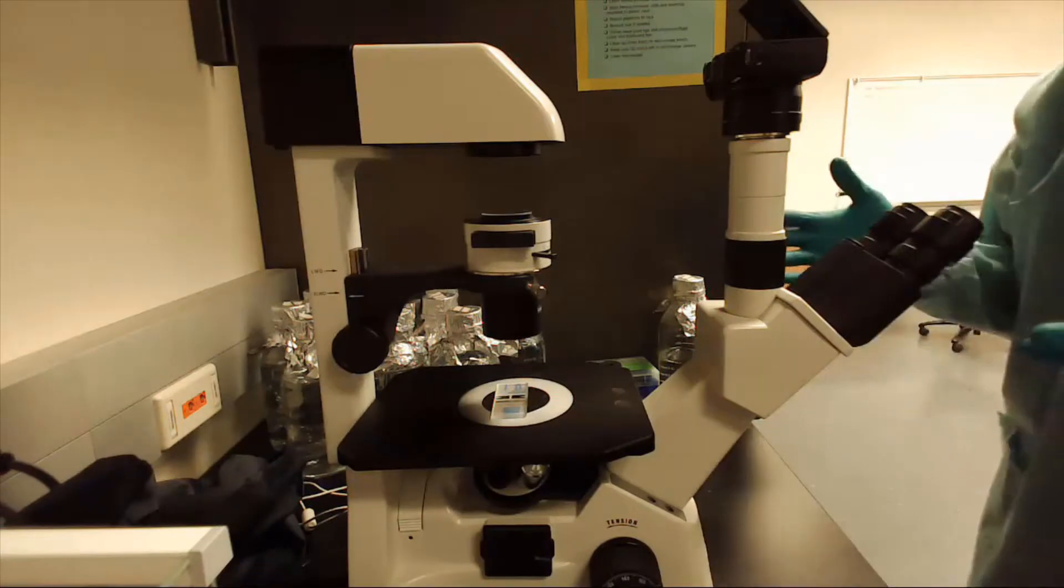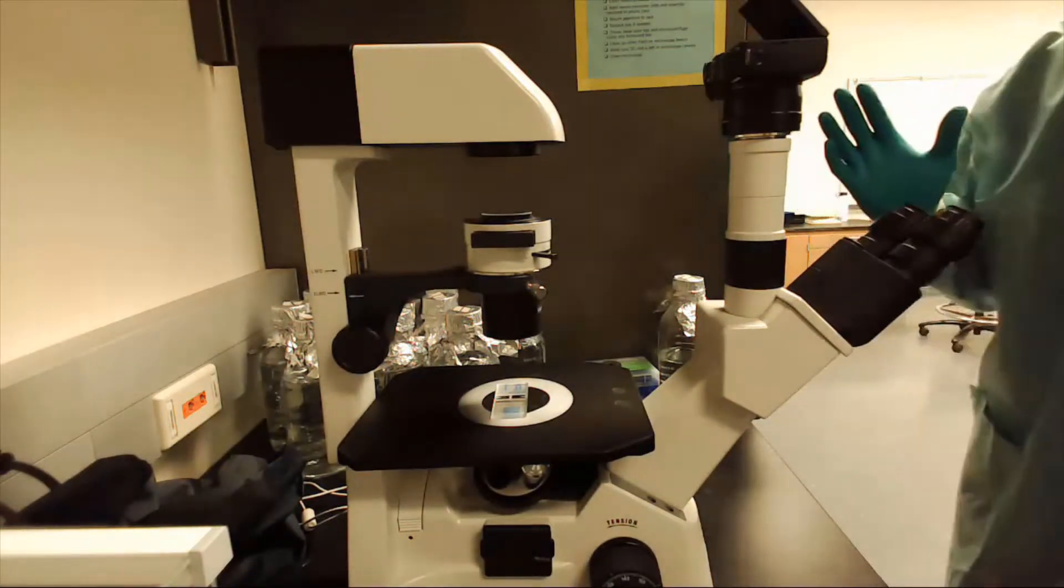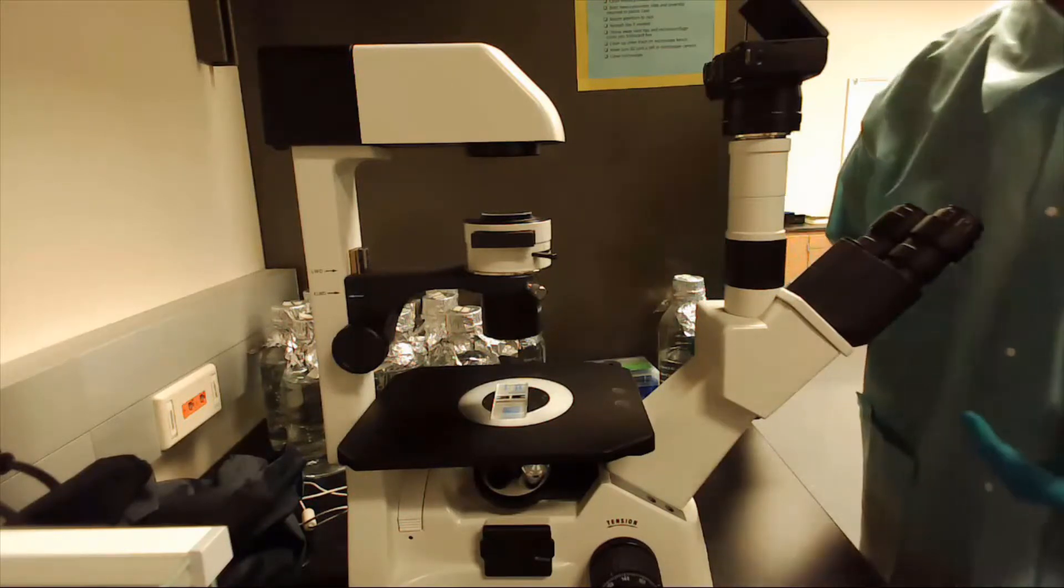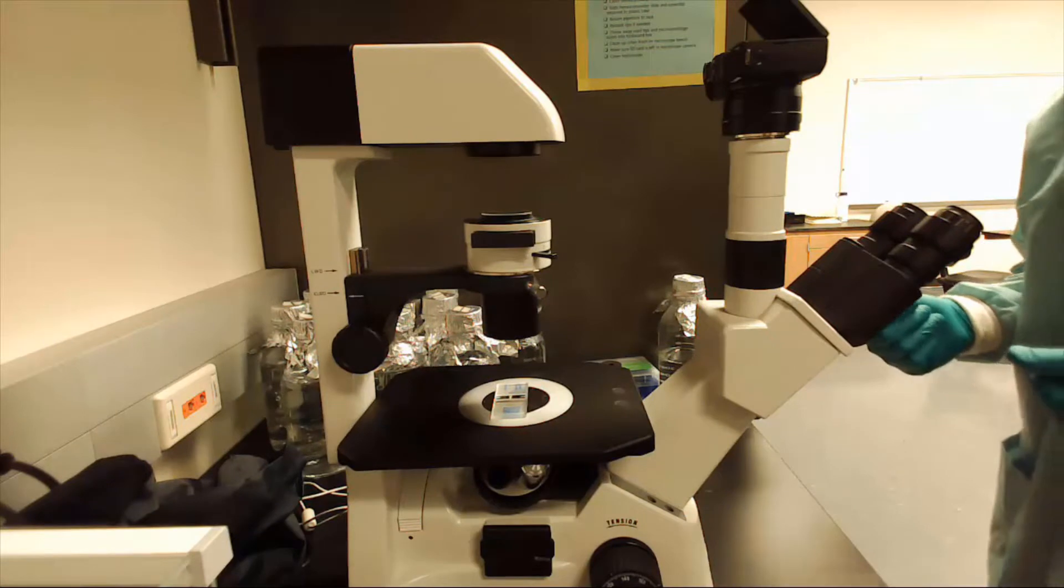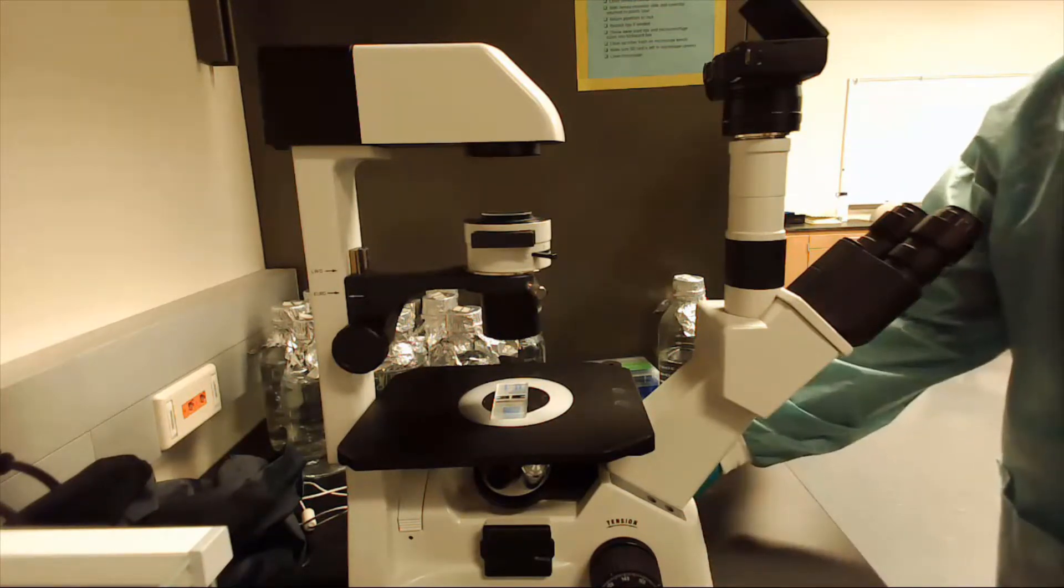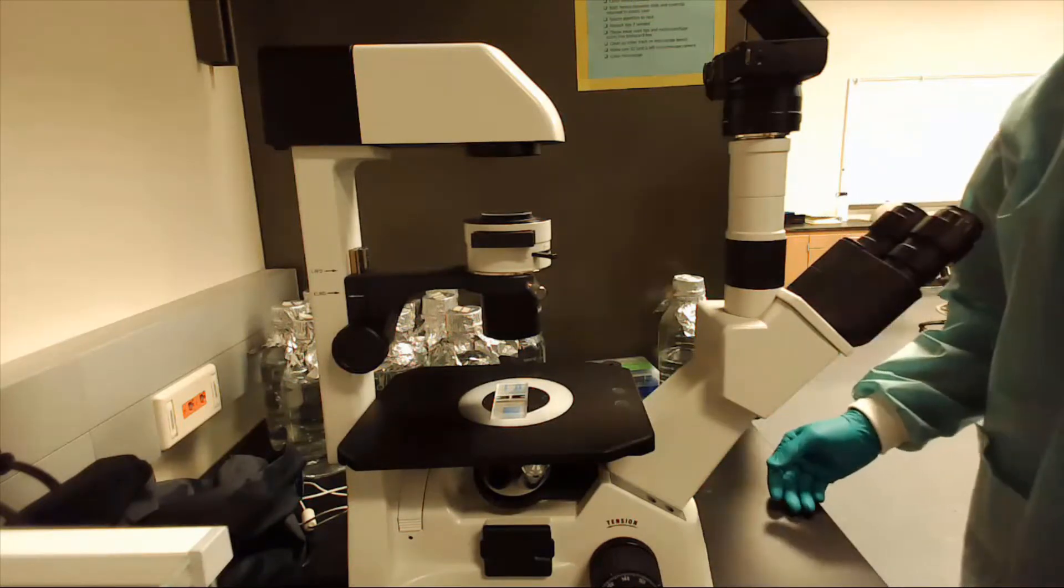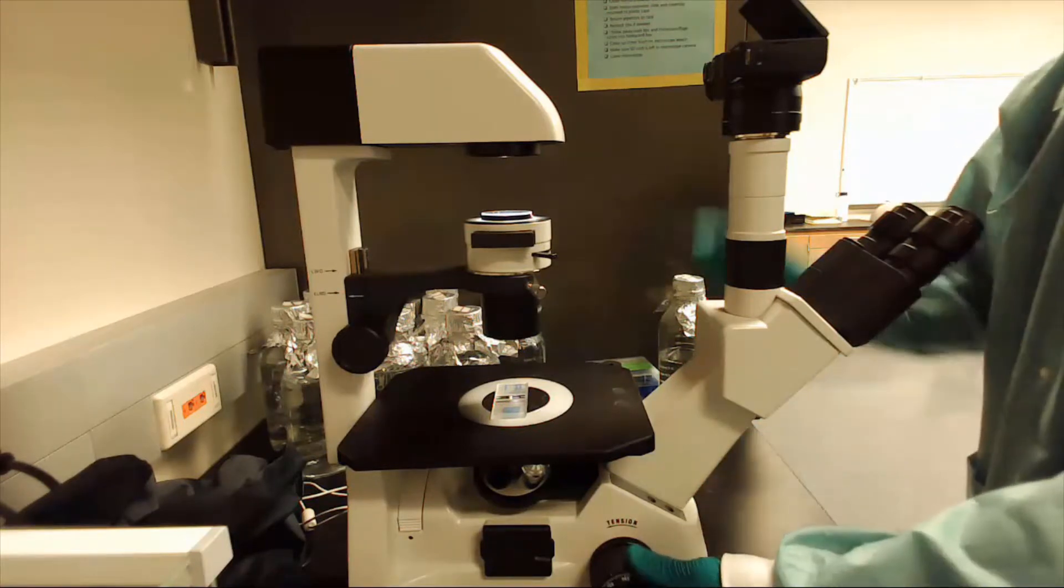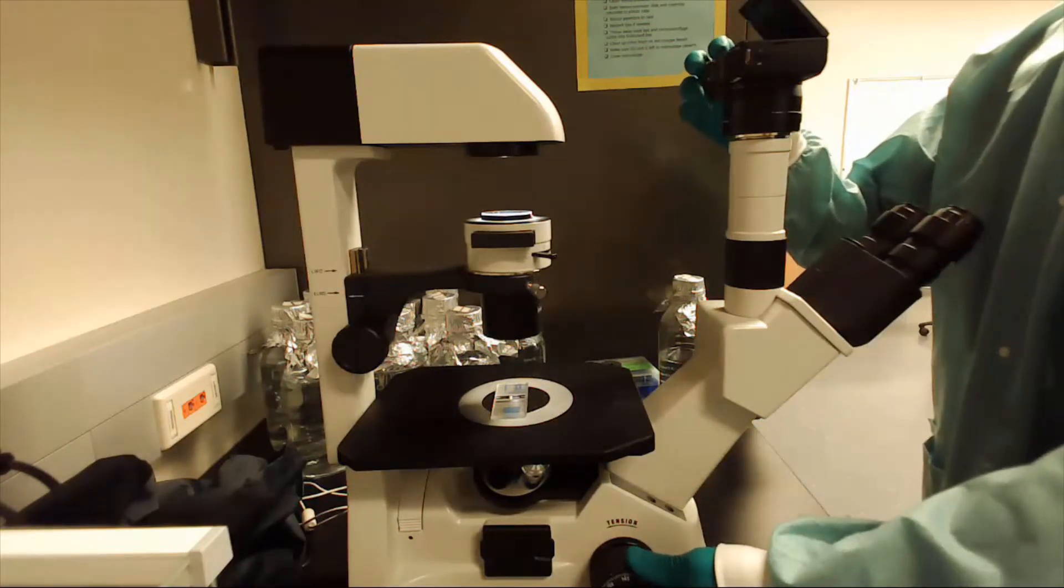Before we use the microscope to look at our cells, I want to show you how we make sure it's set up correctly. We talked about setting up a microscope for Kohler illumination in BME 214L, and so I'm going to show you how that actually looks for real. So to do that, we're going to go ahead and use the hemocytometer slide, which I already put on the microscope, and I'm going to go ahead and turn on the microscope.